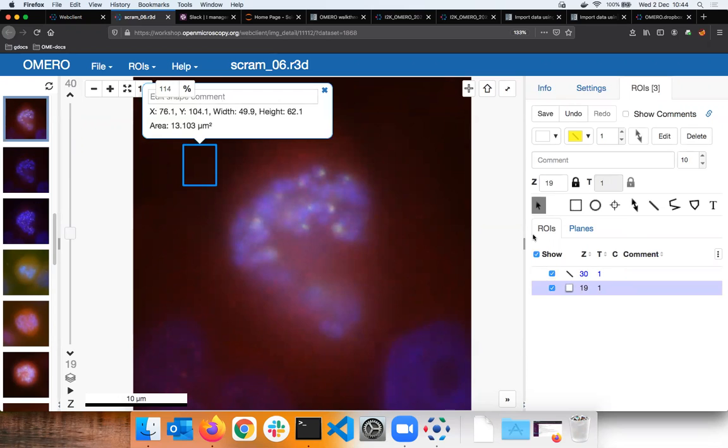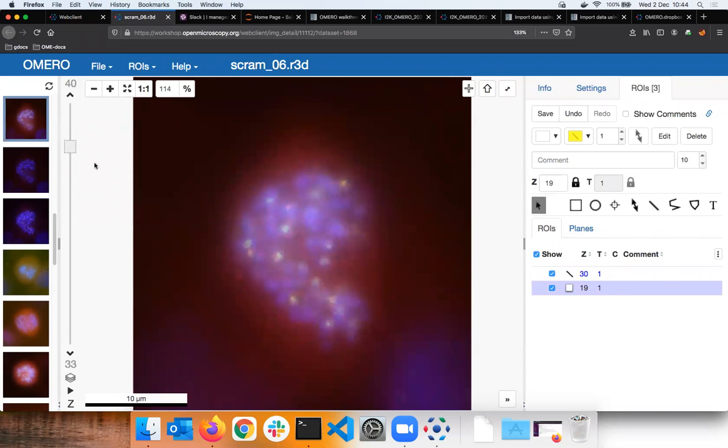So I was always clicking but not dragging. I click and then I move the mouse. Did you manage to do that? Somebody? If somebody is alive there, hello.